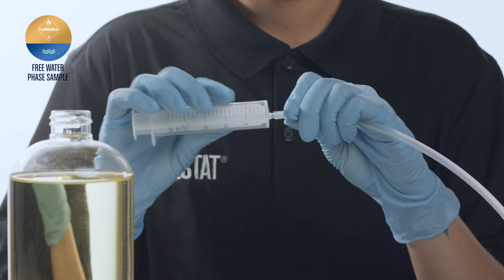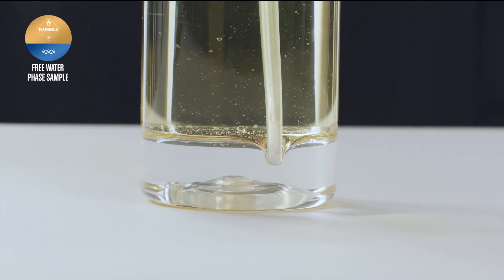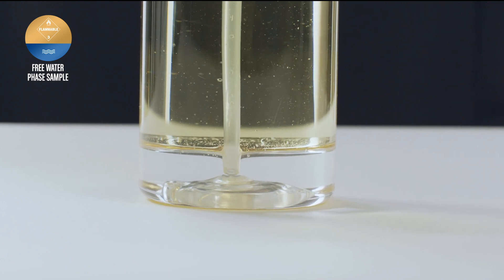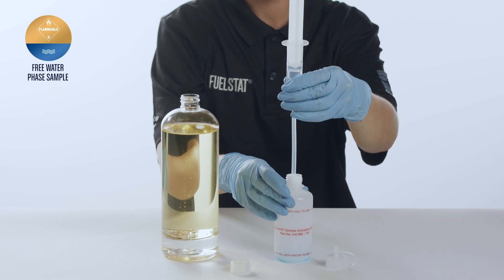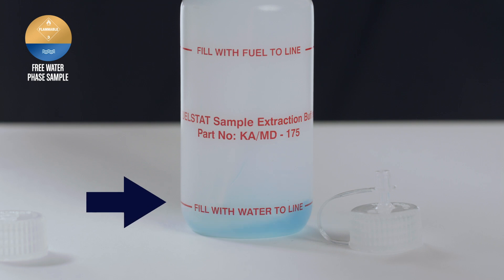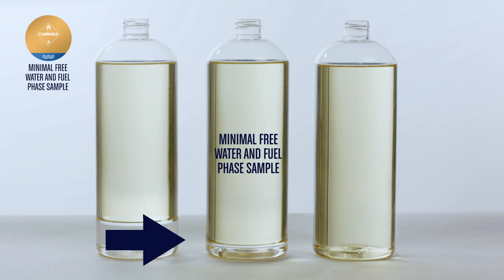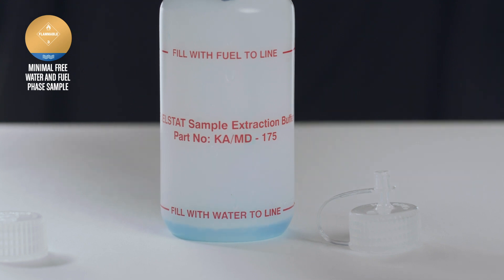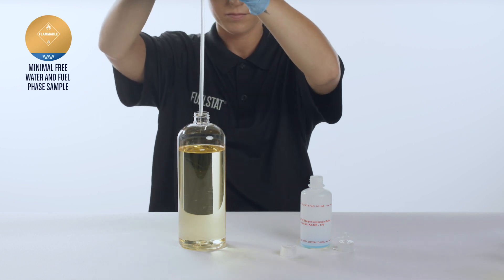Push the extraction tube onto the end of the syringe as shown, then use the syringe to extract 15 millilitres of free water from a fuel water sample. Fill to the bottom water line of the test bottle. Where there is only minimal free water evident, do not worry if the water sample will not reach the bottom water line — transfer the free water that can be seen into the test bottle. Then reinsert the syringe to extract fuel from near the bottom of the sample to top up the test bottle to the top fuel line.